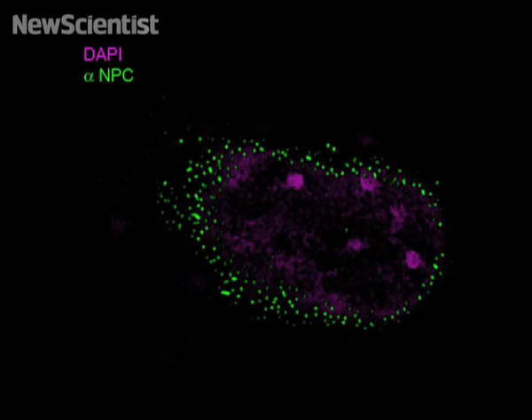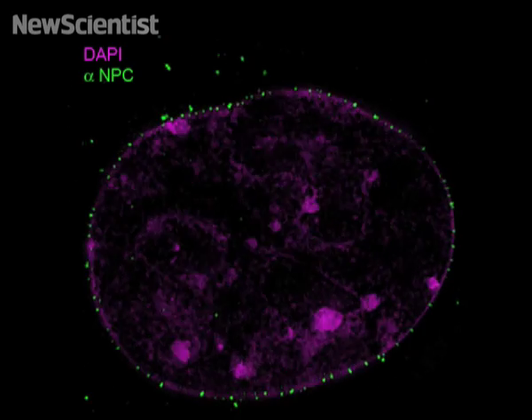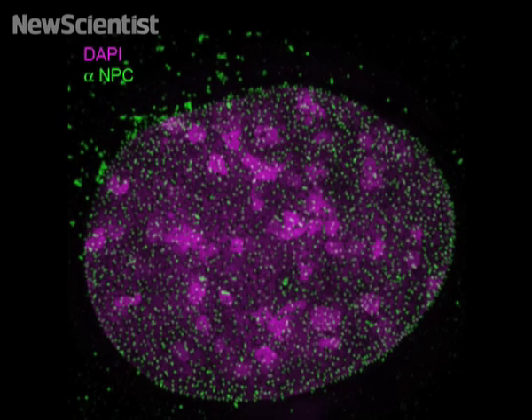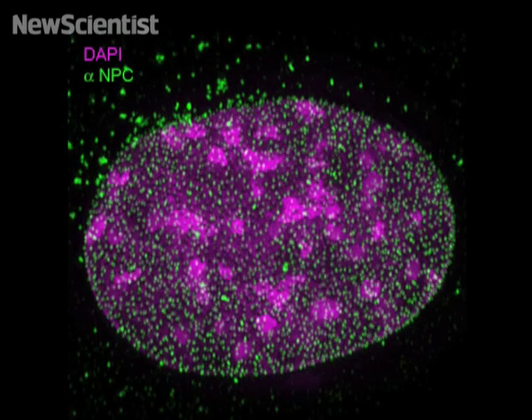The power of light microscopes to resolve fine details has just doubled. A new technique can distinguish tiny structures inside cells.